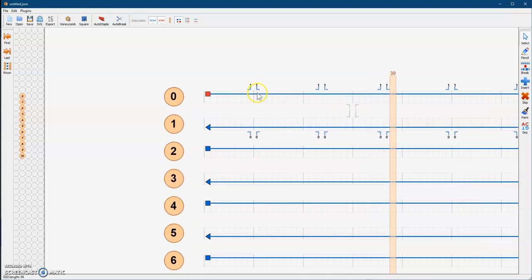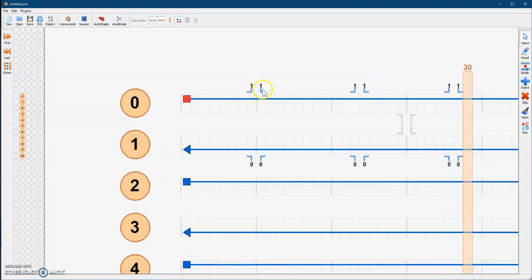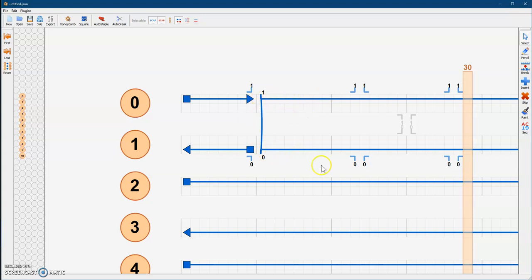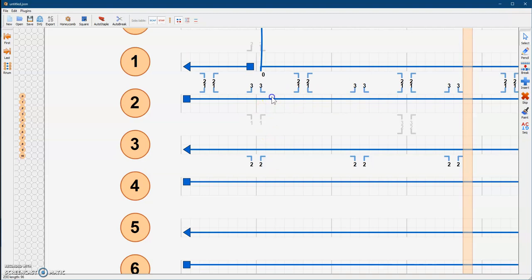What we want to do is go to these crossover points. You can tell which direction these crossovers lead to — this one tells you the crossover is going to close off going in this direction. Look at the direction of the L: it crosses over, makes a loop coming toward the center, and crosses from the 0 position, while this one tells you it goes to the 1. And then from the 1, it tells you this one goes up to the 0. That's what these crossover points do. So we're going to select number 2 at position 2 and then go down to 3, because we want to connect 2 and 3.